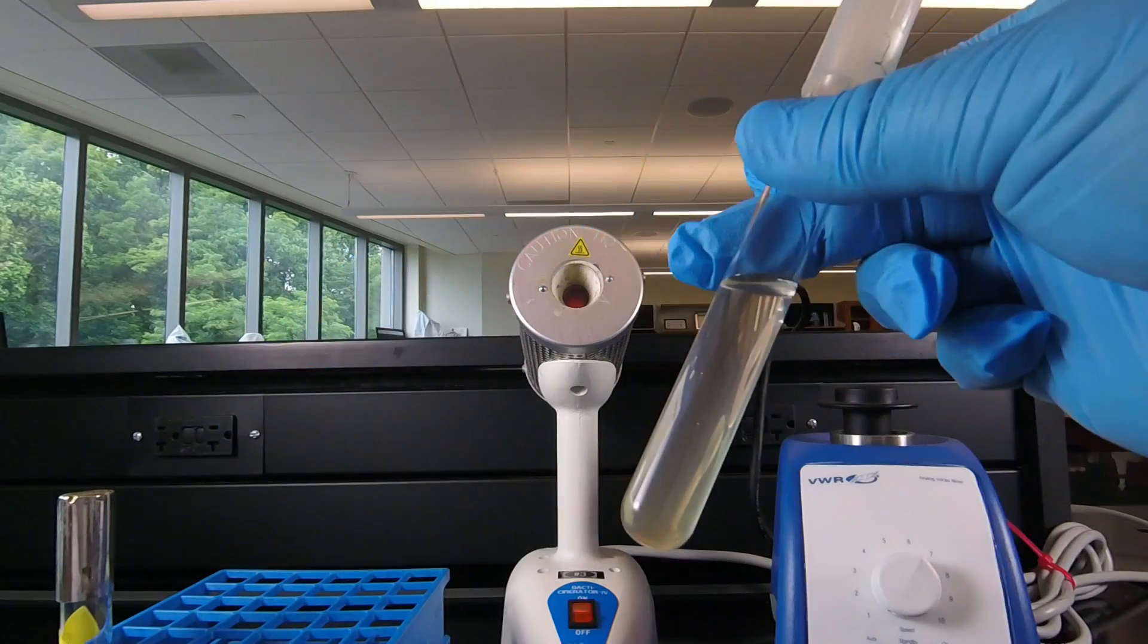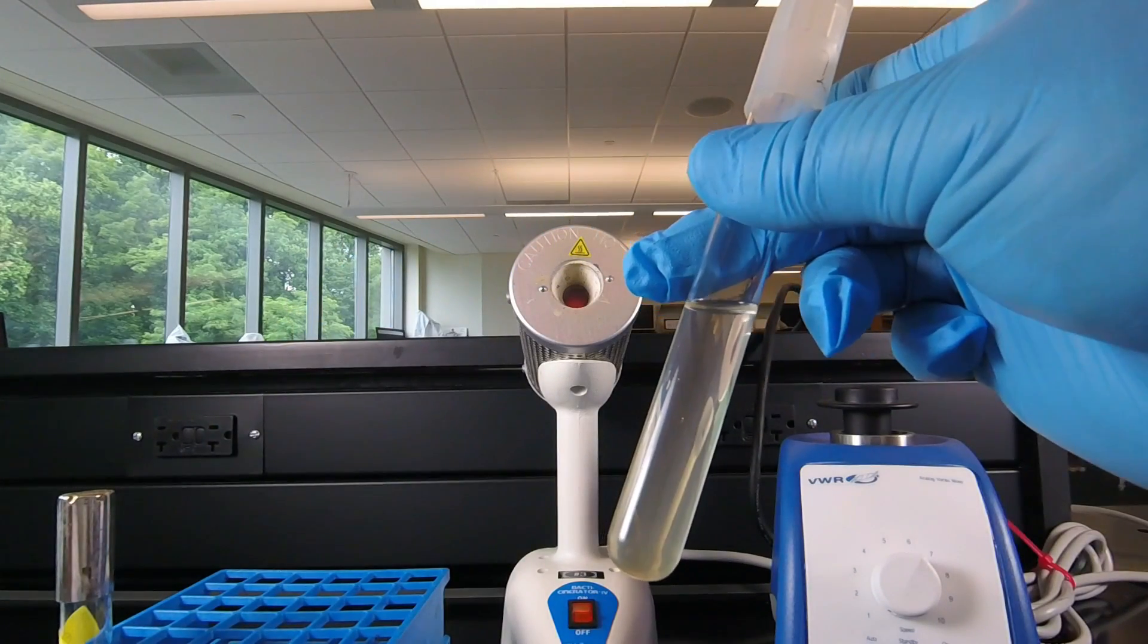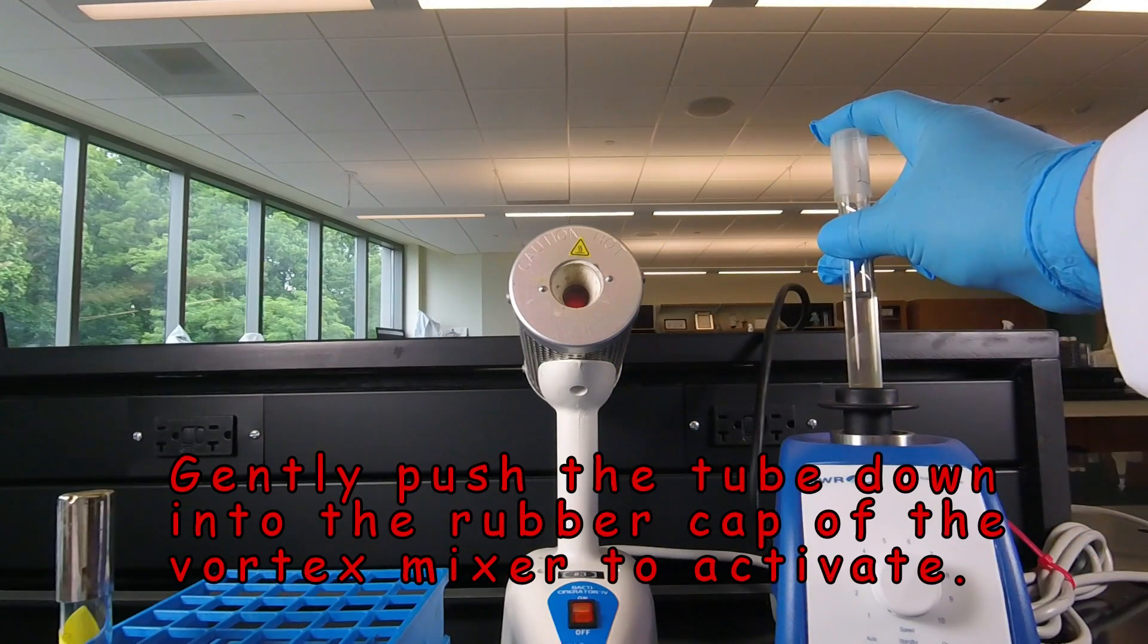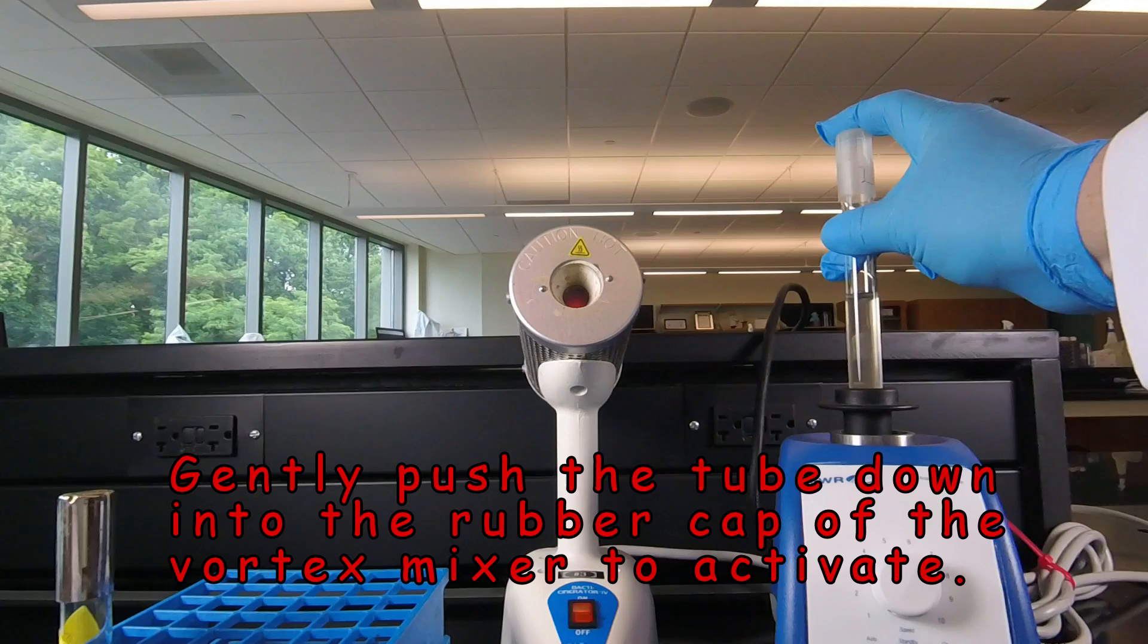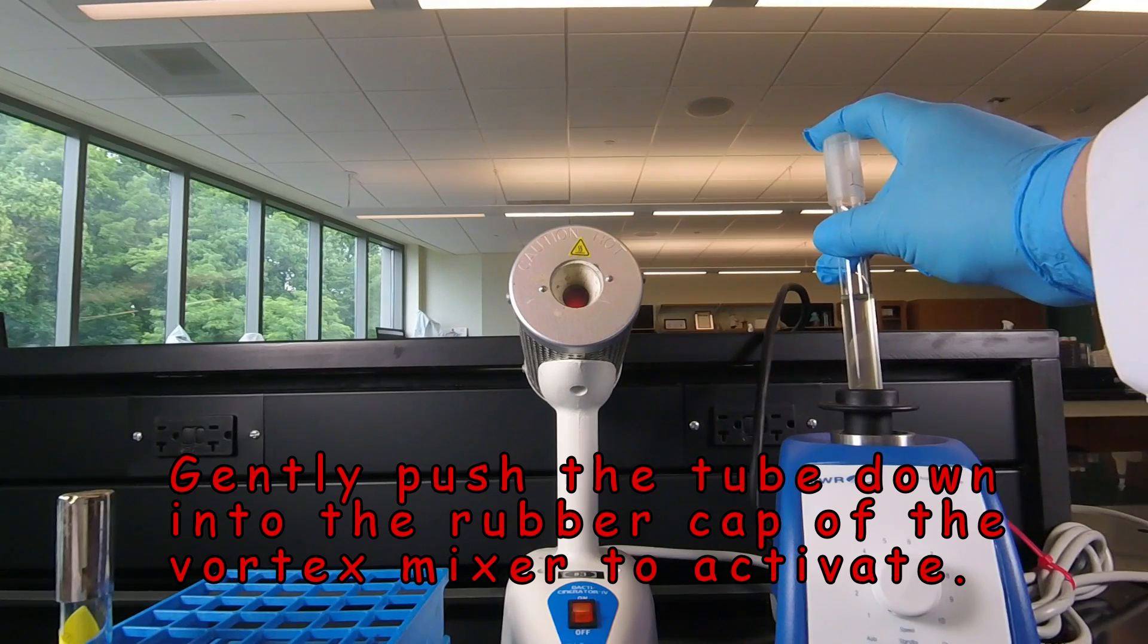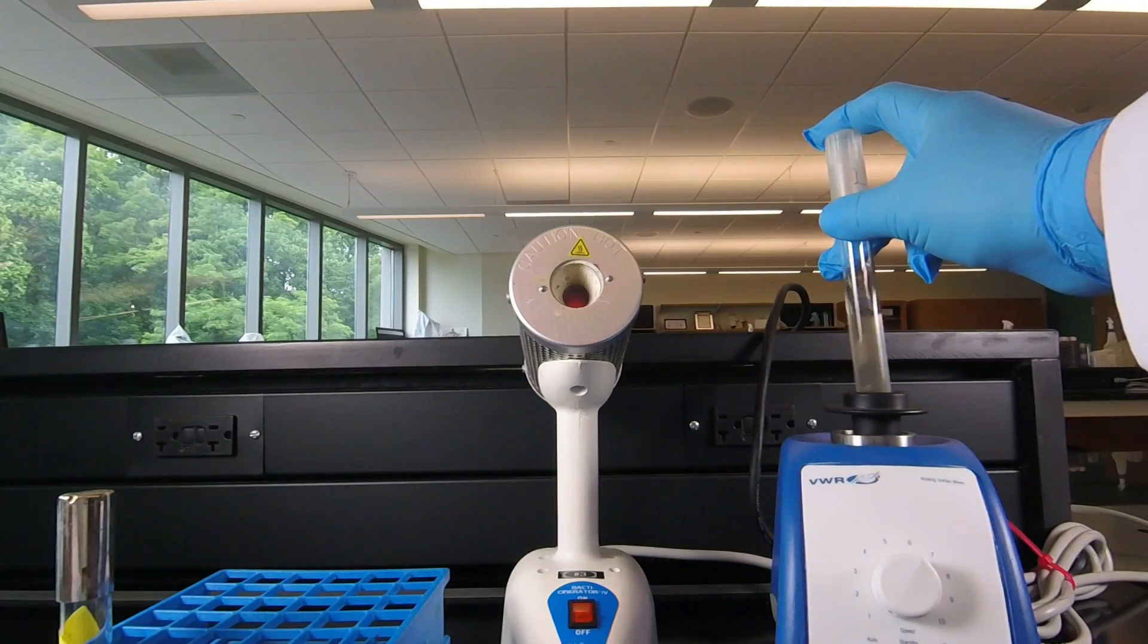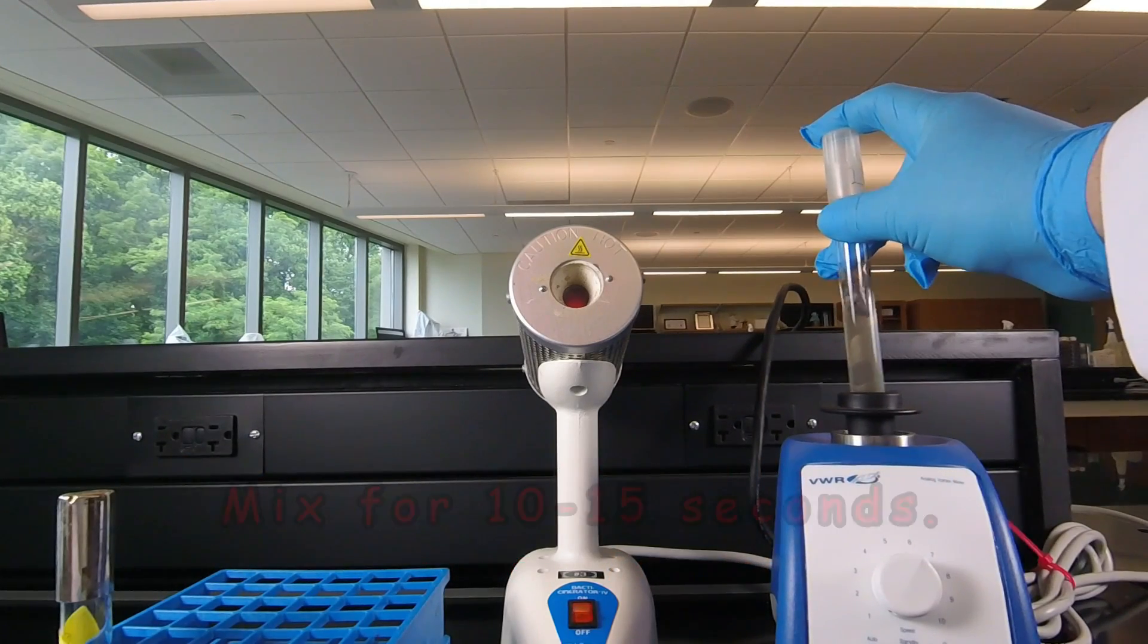So here's the tube we just added the E. coli to. Before we take any bacteria out of this tube we're going to put it in the vortex mixer. Kind of hold the tube so you're holding the glass in the cap and then just put down gently and it'll start vortexing. And we're going to do that for like I said about 10 or 15 seconds.